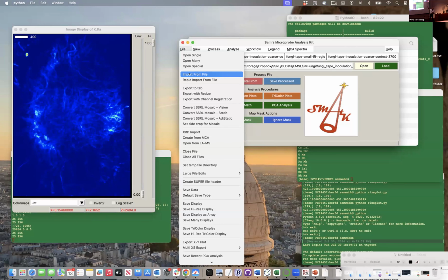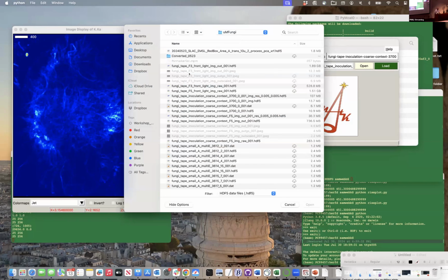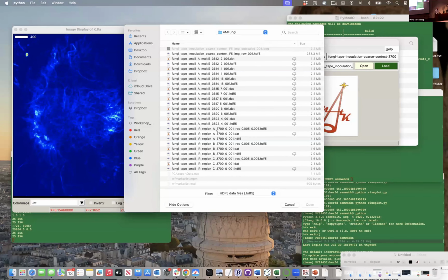And so the import button, that's a tab there, is actually the rapid import, which will not handle doing manual adjustments, we'll say. So I can import this smaller data set here. Here we are at a 5 micron version of that. If you notice, the data set we had before was 5 microns as well. I often get that left pixel that I hate.